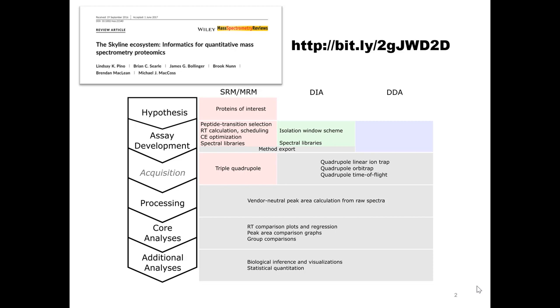There's an external tool called population variation from PNNL that you can test any of the proteins in your Skyline document for variants that are prevalent in the population. It queries a database. So all of these are kind of wrapped up in the Skyline ecosystem.